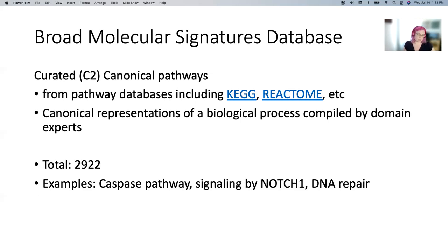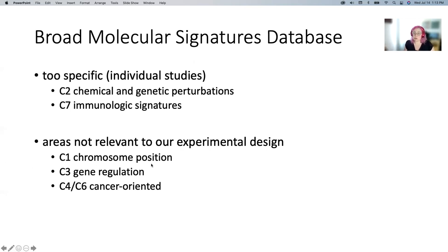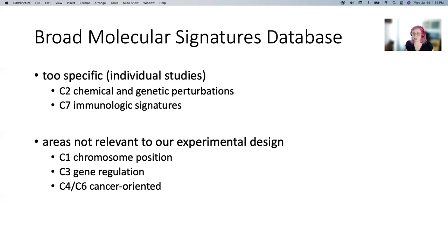Both simple enrichment and GSEA are going to use these same gene sets. Other ones worth noting if you're working in a different area: things we've found to be too specific are chemical and genetic perturbations and immunologic signatures. Areas we haven't been looking at include chromosome position, which is useful if you're looking at chromatin structure, and gene regulation, which is transcription factor oriented. There are also a couple that are cancer-oriented, which for our tuberculosis research isn't relevant.